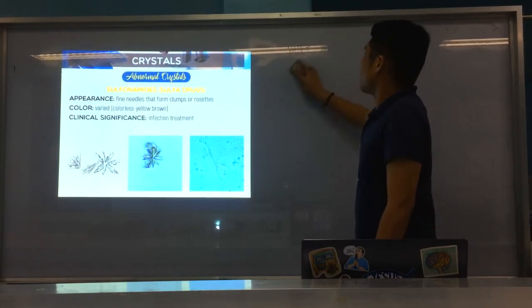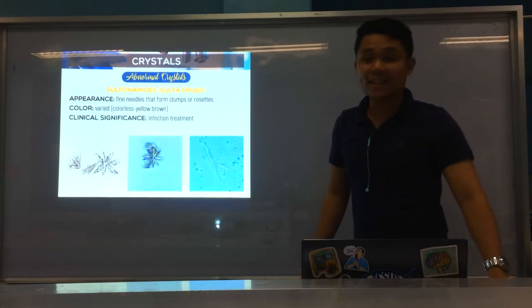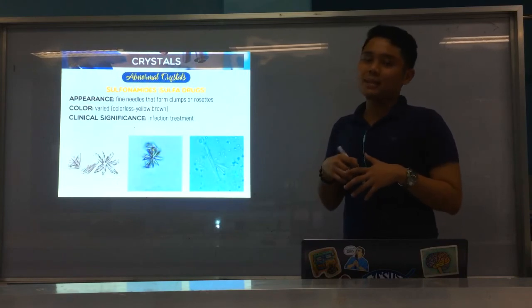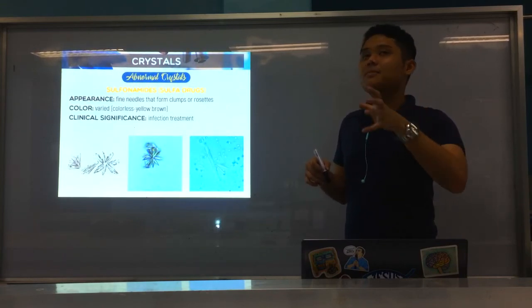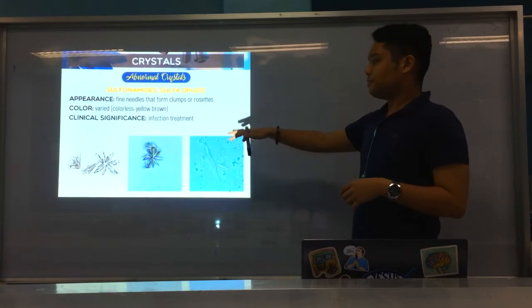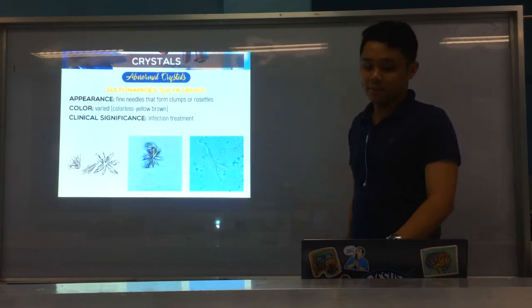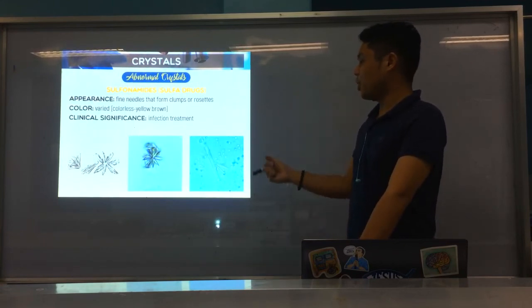Yeah, usually if nag-inom ka og mga treatment for UTI and you have poor hydration, wala kay water nagiinom, then may possibility na mo precipitate ang sulfonamides na imong intake. Pero most of the drugs nga sulfonamides karon, soluble na daw sa water. Again, seen siya in infection treatment, usually UTI, using these antibiotics. Sulfonamides are antibiotics, okay? All right, so fine needles, na clumps or rosettes.